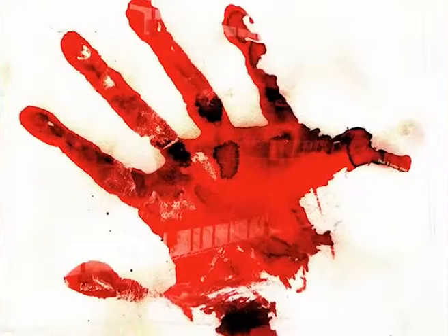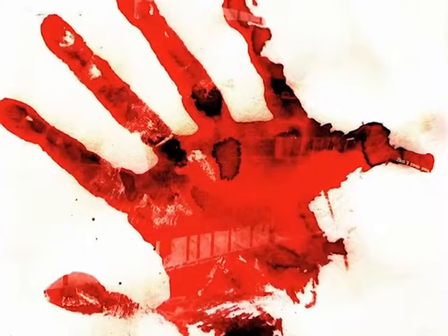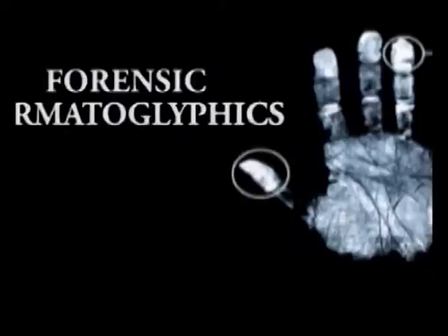To a mixture of diethyl ether around 70 ml and glacial acetic acid around 1 ml, leucomalachite green around 1 gram and hydrogen peroxide 20%, 0.5 ml are added. This working solution is sprayed onto the surface impinged with blood finger marks. On drying, the fingerprints are visualized.